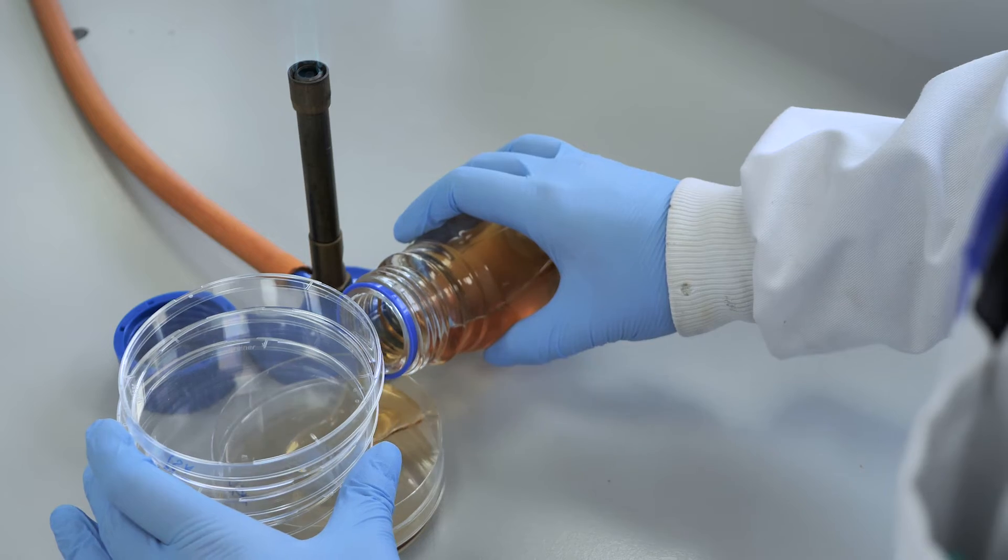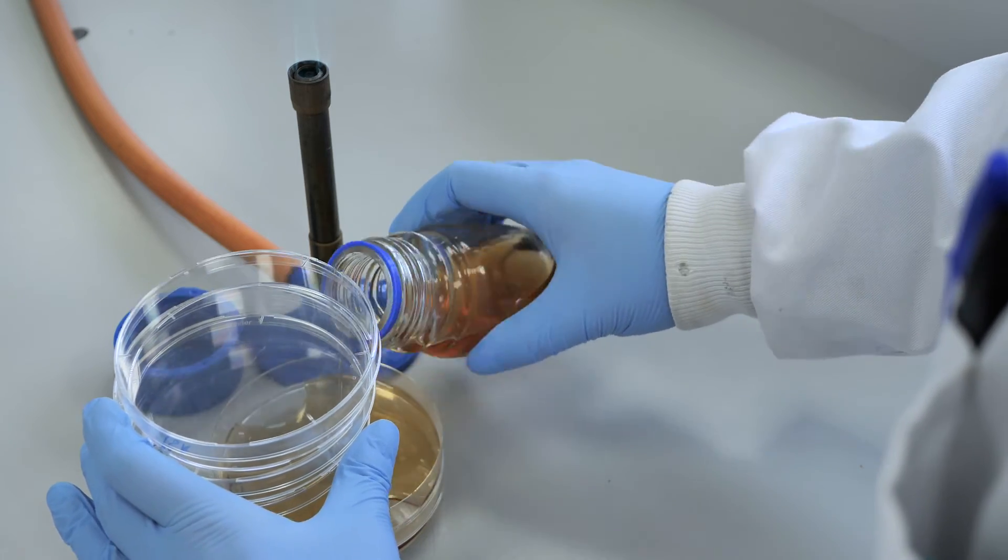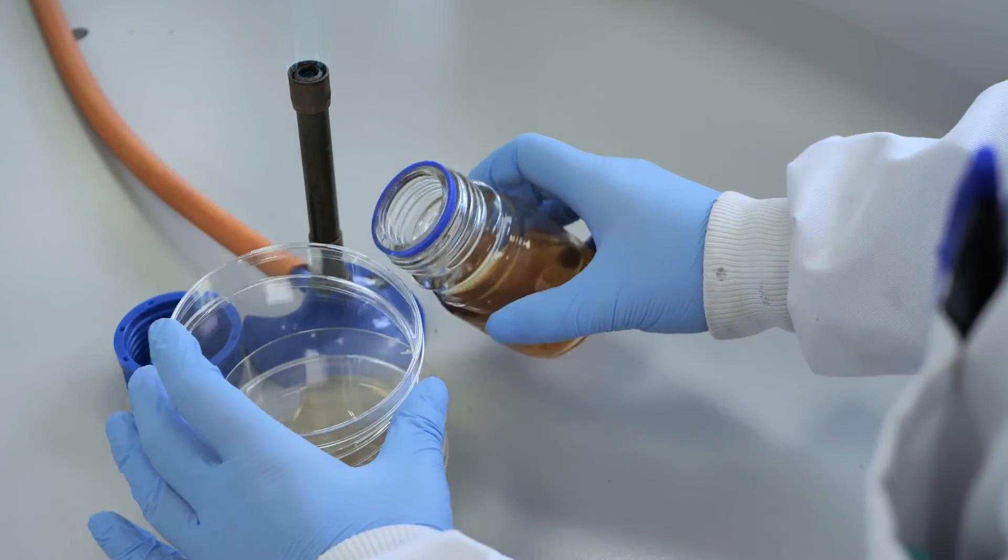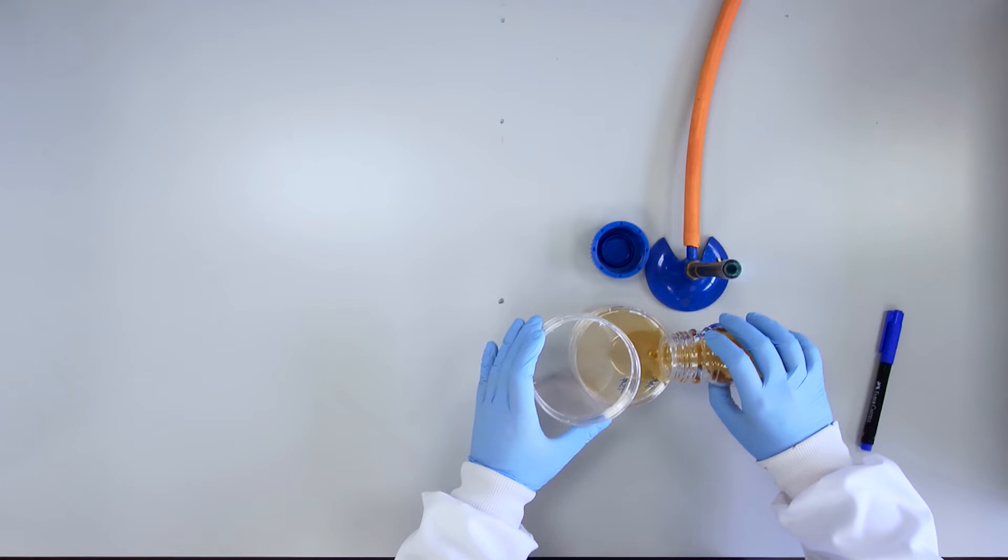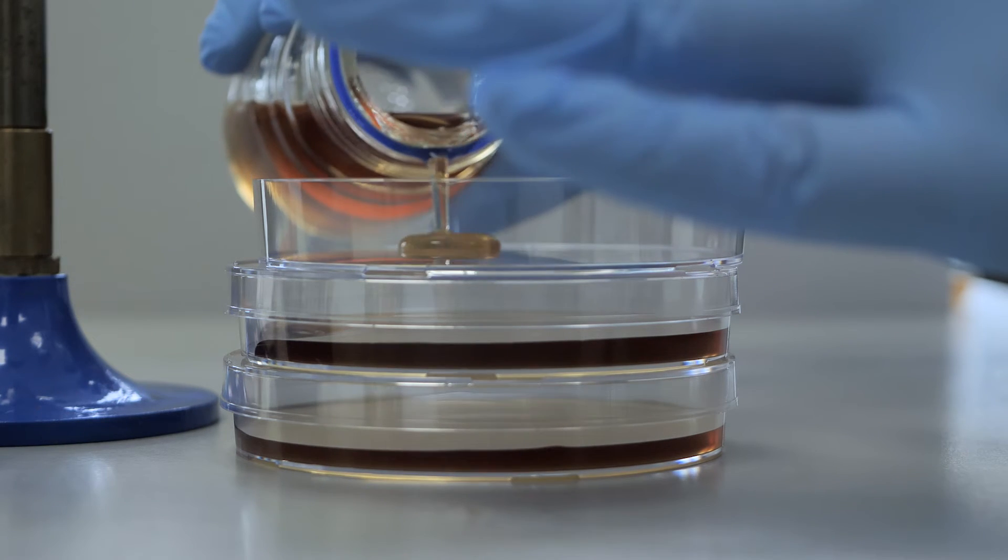Flame the neck of the bottle. Now lift the lid of the second plate and pour in 20 to 25 milliliters of molten agar and replace the lid.